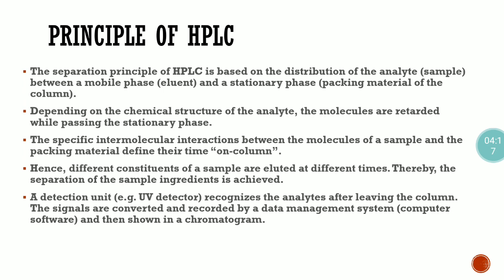A detection unit recognizes the analyte after leaving the column. The signals are converted and recorded by a data management system and then shown in a chromatogram.